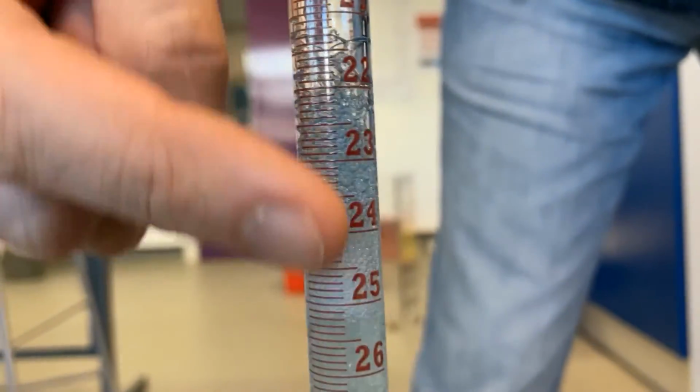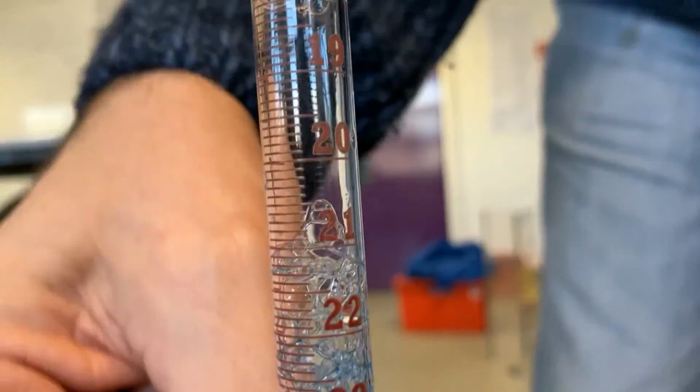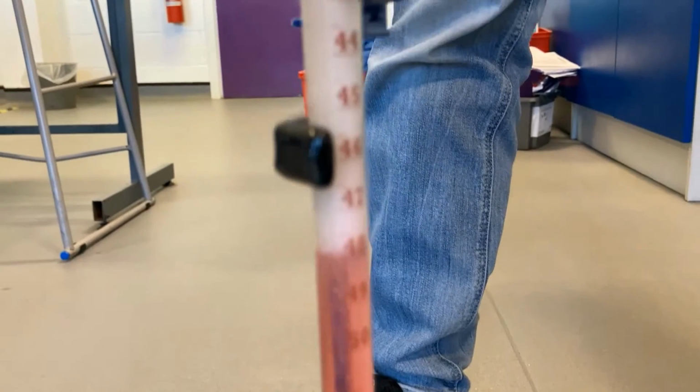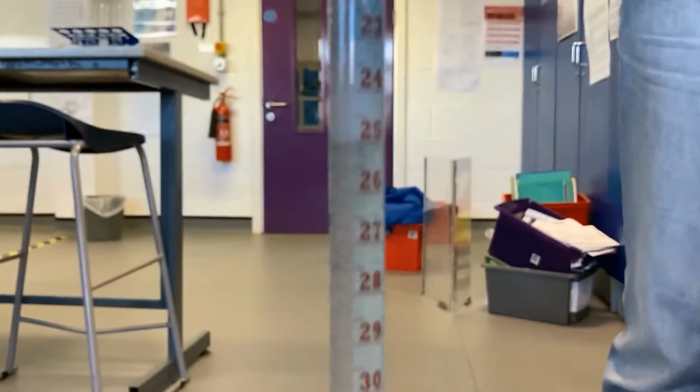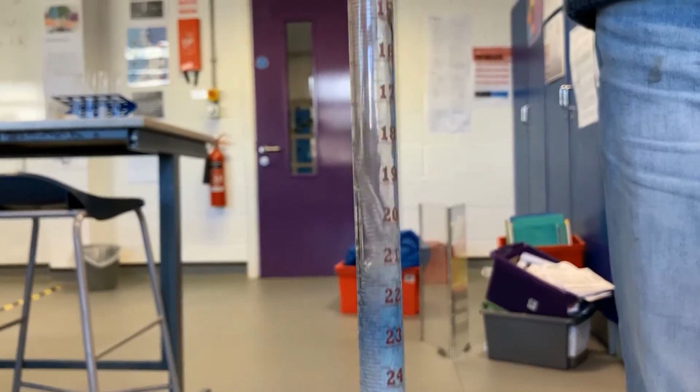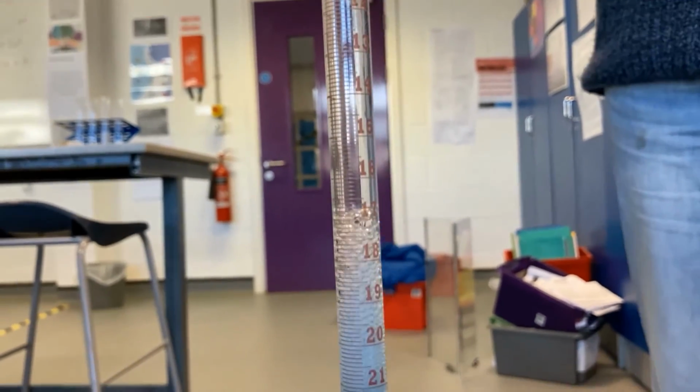So, again, up at the top, we've got the blues, we've got the alkalis up here, which is the alkali that went in. In the middle, we've got neutrals and stuff, and down the bottom, we've got all the acids. And they're nicer. Let's get some more in. And I'll just let that run.